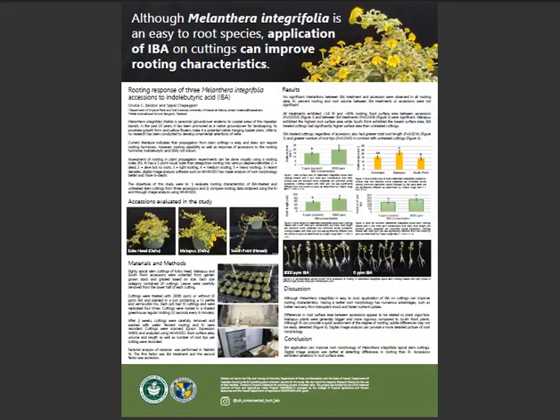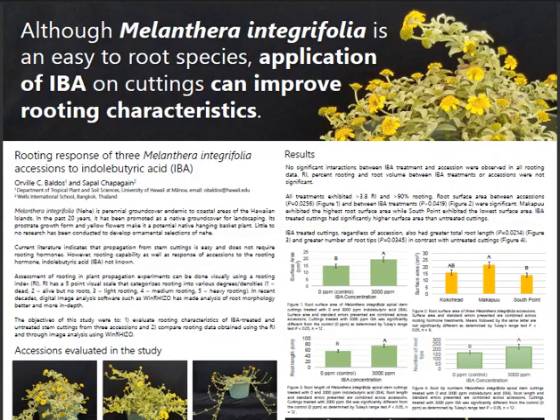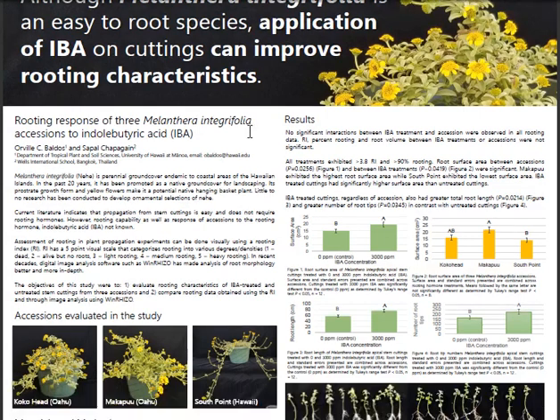And this research was done actually by a former high school student who was an exchange student during the summer. He worked in our lab, and we did a simple experiment on rooting of Melanthera integrifolia. So we looked at the rooting response of 3 accessions of Melanthera integrifolia and how it responds to the application of IBA or indolebutyric acid.